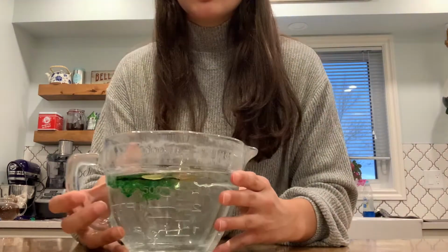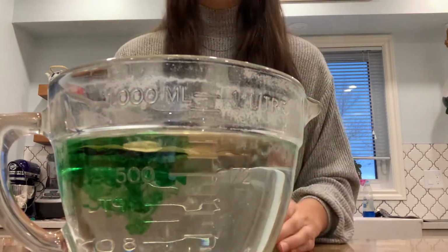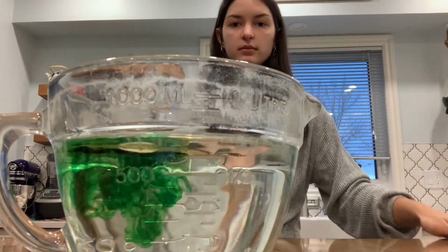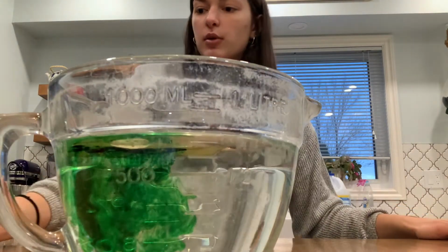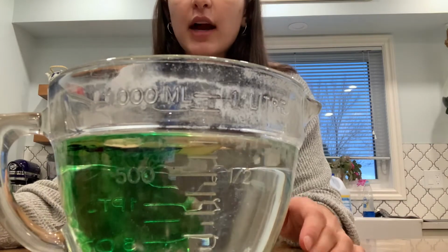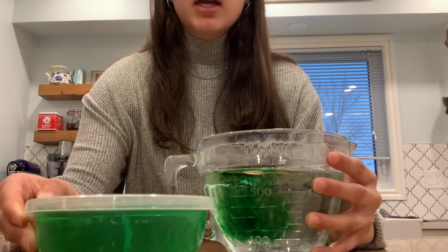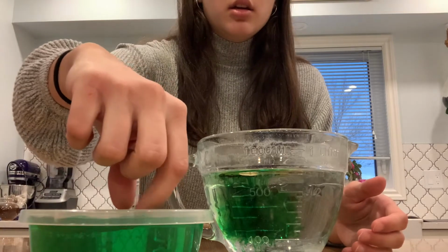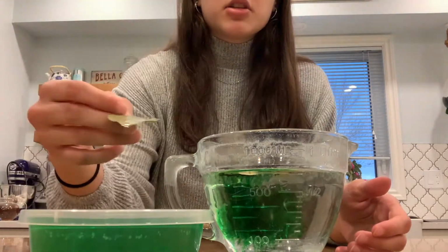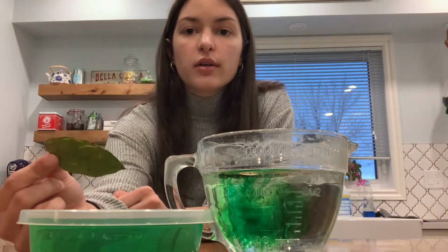And then, as you should be able to see, I'm gonna put it closer. The flavors are being extracted from the bay leaf into our solvent. That's kind of neat. And then over time, because we don't want to wait here forever, we will eventually have a mixture like this with our solvent containing just the extracted parts, and then this other part of our mixture, which is just our original bay leaf with no more of that food coloring or stuff we wanted to extract on it.